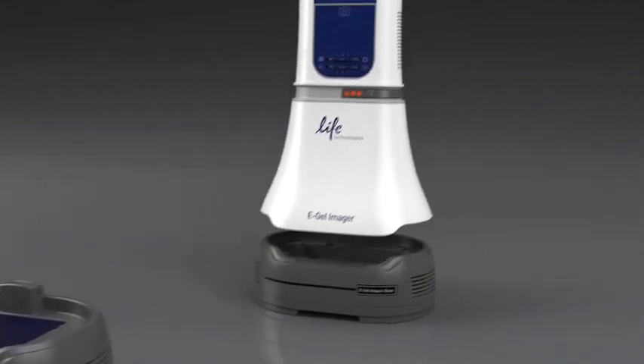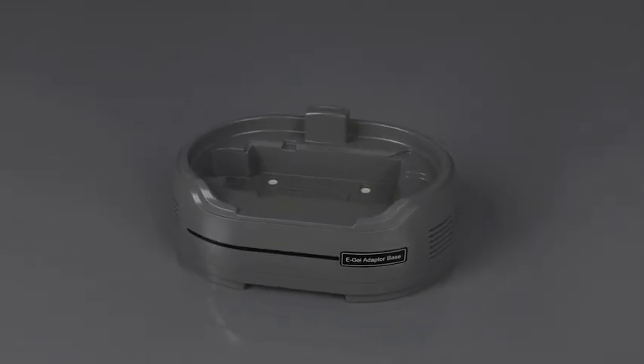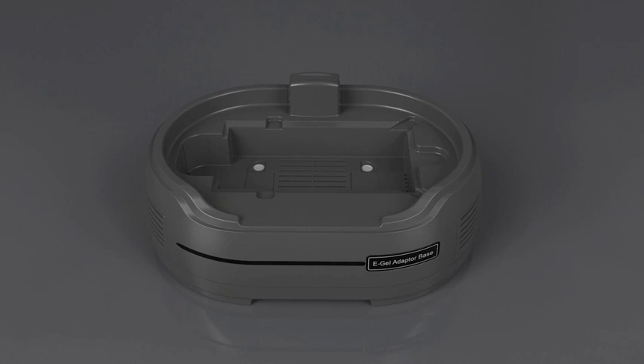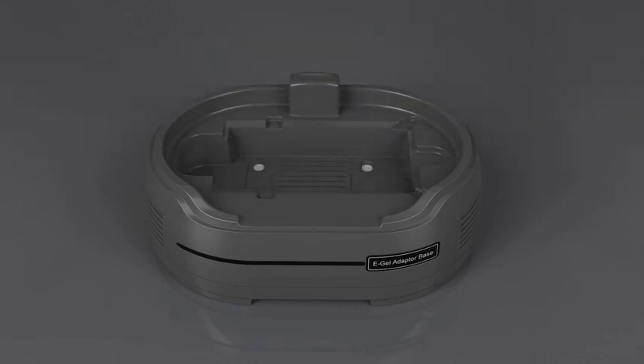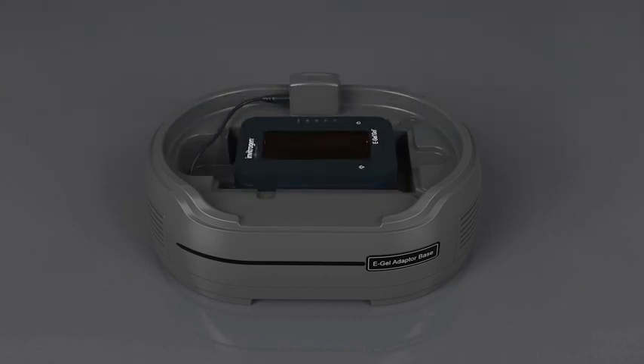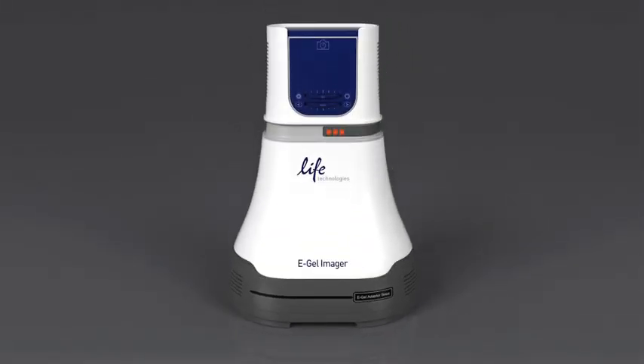Finally, there's the eGel Adapter base. The eGel Adapter base allows real-time visualization and documentation of eGel agarose gels run on the eGel iBase platform with the eGel Safe Imager, or eGel Go quick check gels run on the eGel Go system. Power is supplied to either system by a power cord within the base, so there's no chance of external light entering the system and distorting your results. With the Adapter base, you can document real-time progress of your eGel runs like never before.